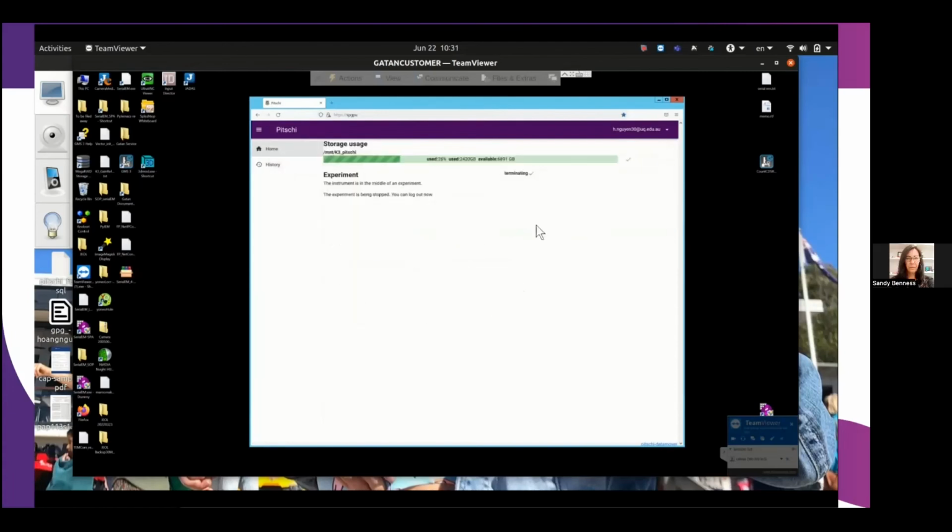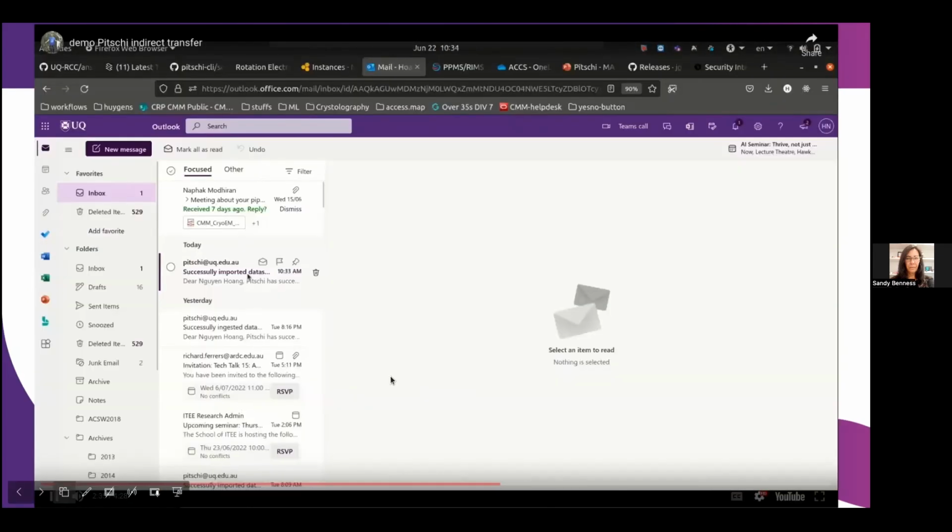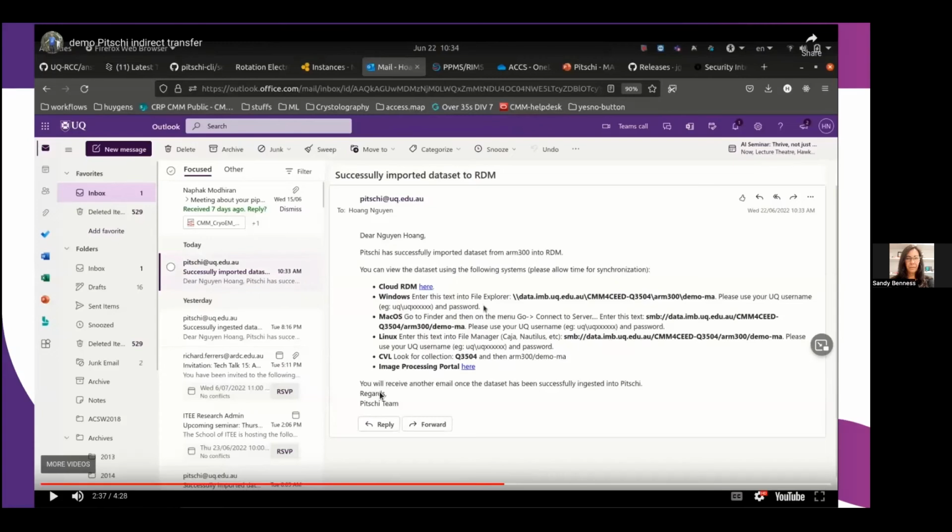I've got a question again, sorry. Just wondering, do you have different levels of access into this system? I know some of our laboratory managers like to be able to see all the data from the instruments that they manage, so that they can see that experiments are conducted correctly, and they just like to have that overview of the instruments that they manage. Is that something that's possible?